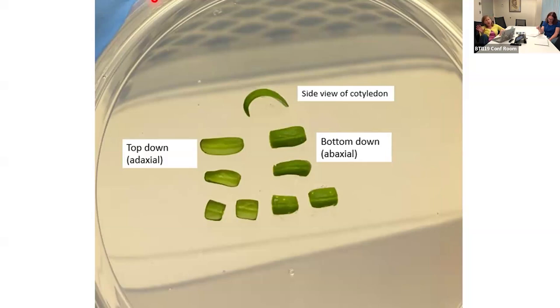We certainly don't want to use leaves from the greenhouse because working with other systems where I had to, or in chambers, it was kind of hit or miss with contamination sometimes and having to clean up the leaves. So again, if you look in the literature, I'm sure there are protocols that do use leaves. But again, we don't because of the number of different genotypes we have to work with. The cotyledon system is just best for us. Thank you. You're welcome.